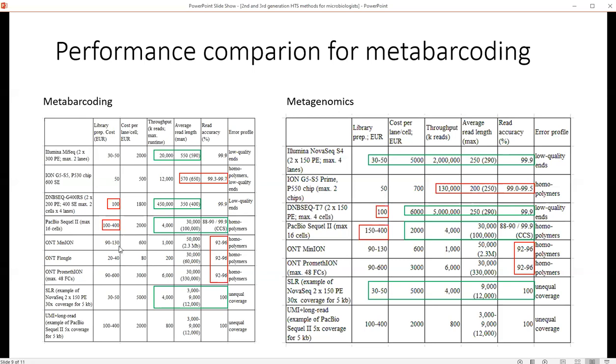Oxford Nanopore methods are unsuitable for metabarcoding because of the low read accuracy, but when combined with UMIs, they may be competitive on some occasions, although there are no published metabarcoding studies using UMIs and nanopore combinations. Here again, if you want to have long barcodes, then synthetic long reads combined with Illumina or MGI Tech sequencing might also perform pretty well.